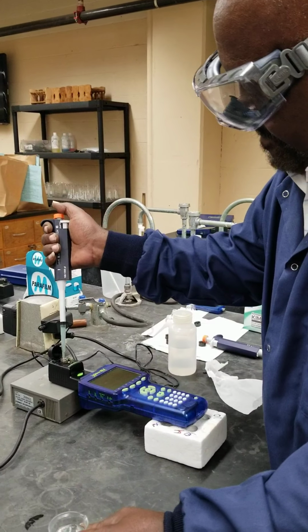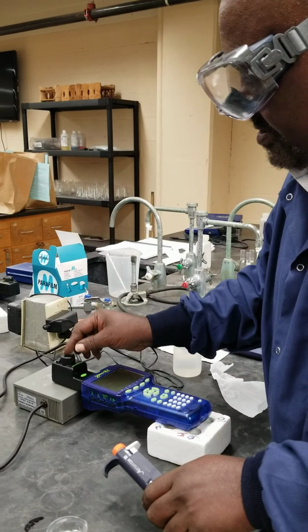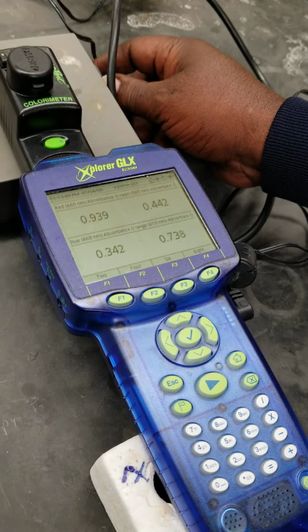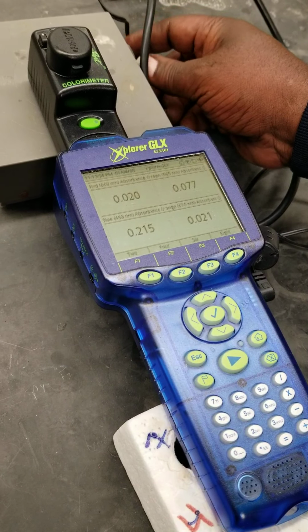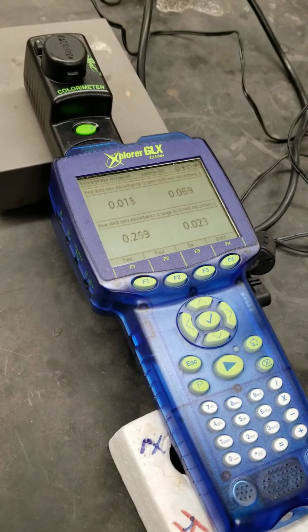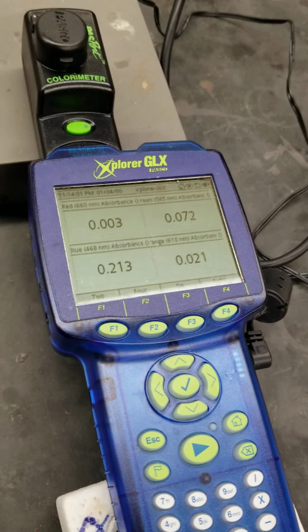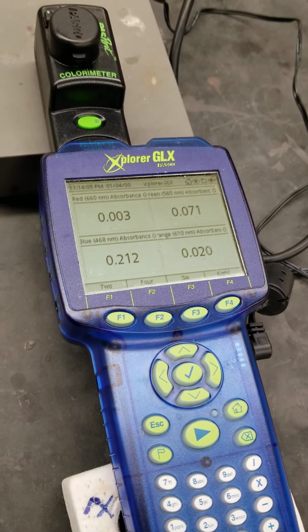Open that. Close that. So after the second addition, the absorbance at 468 is 0.212.